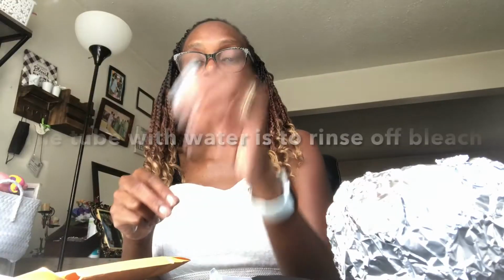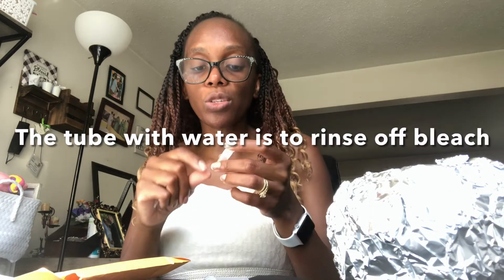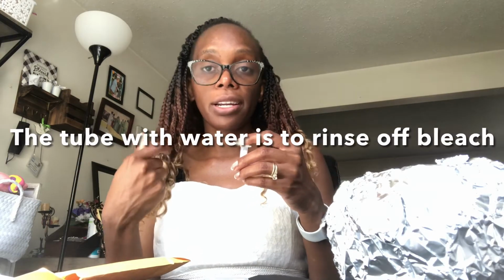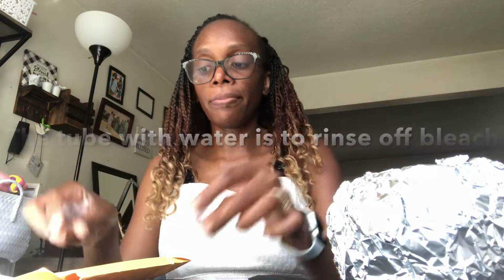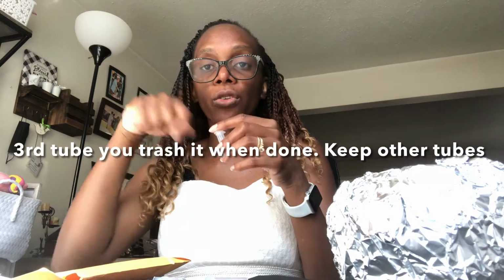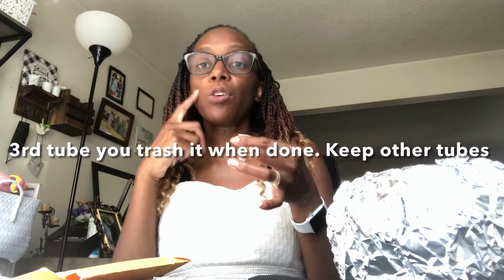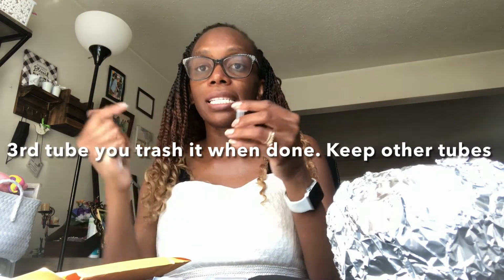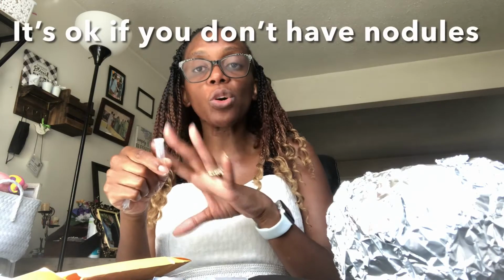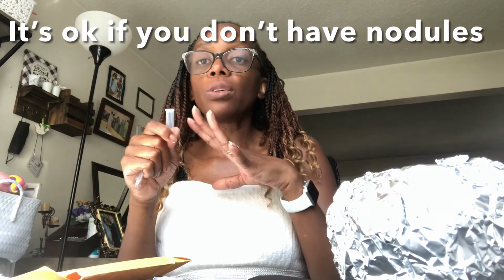Okay, and then we rinse off the bleach, because we don't want that bleach to eventually get to our target bacteria and then kill them. And then the third one, we crush or break open our root segments. Why is that? Because we are looking for bacteria that is inside these roots. Okay, so whether you have root nodules or not, we will still do this.